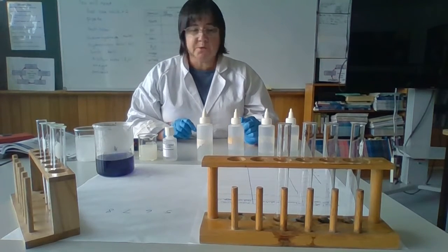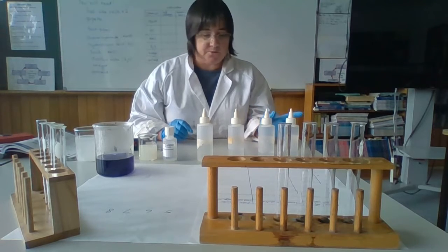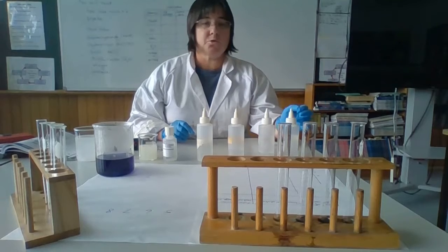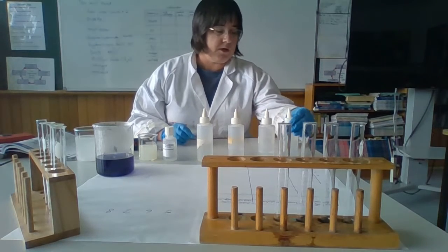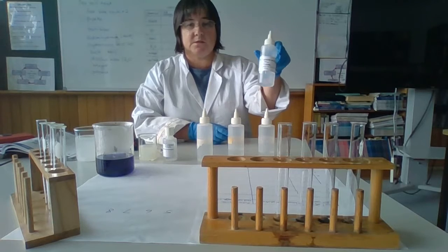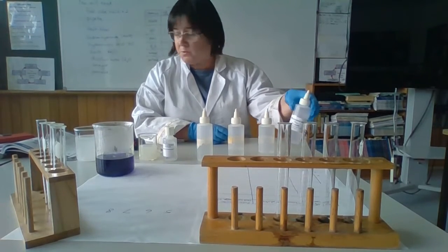So the solutions we're looking at today are 8 different solutions. The first one is something that you wouldn't necessarily get at home. It's hydrochloric acid, because while I'm here in the lab, I can use it. That is a strong acid. So this is 0.1 molar.